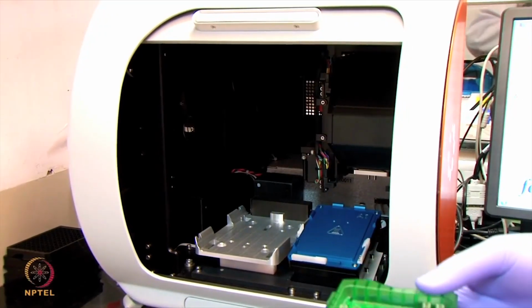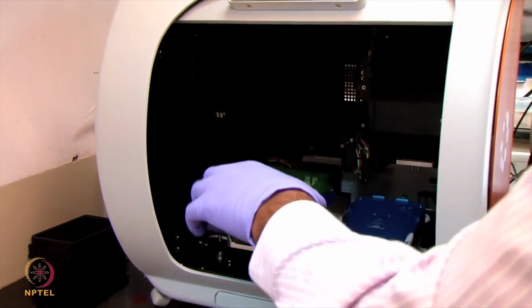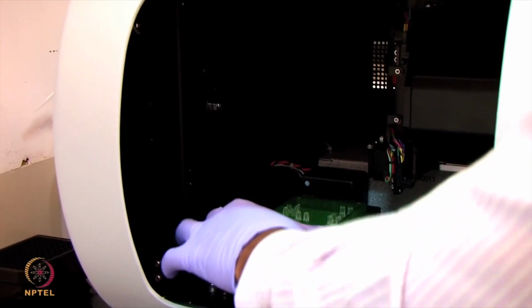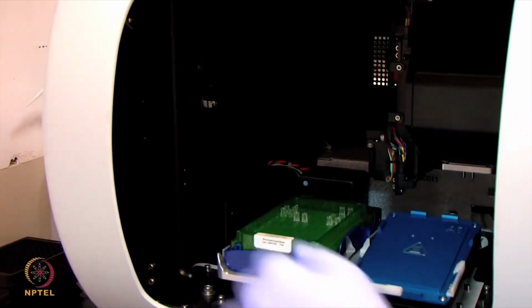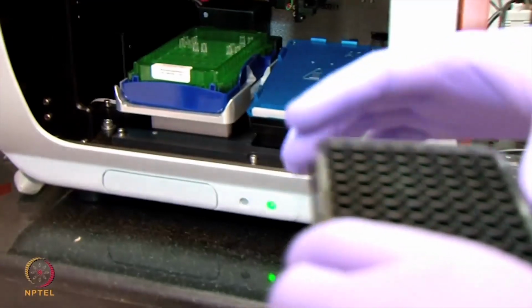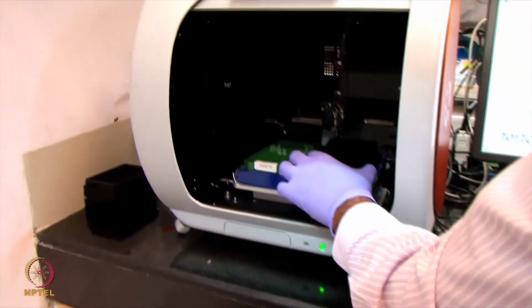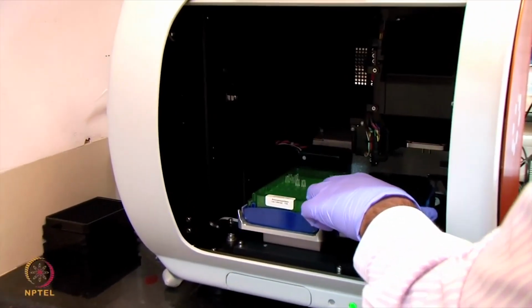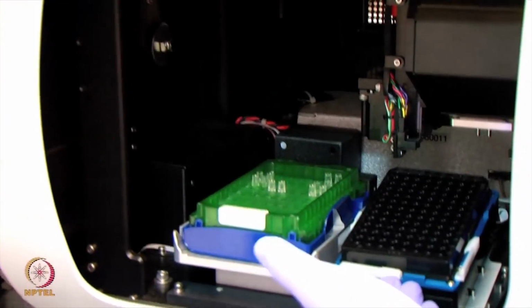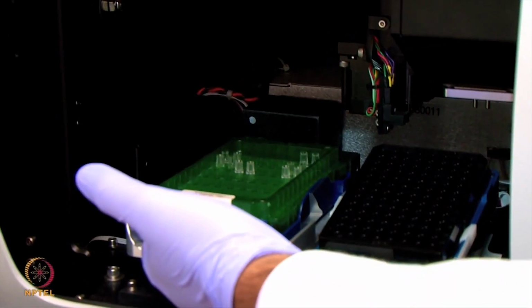Now the sensors are hydrated. I am going to place them in the instrument. The sensor holder I am placing here like this. It should be firmly fixed in the groove. And now I am going to put the sample plate which contains the biotinylated antibody. I am going to place it like this in the sample tray. This particular part we call the sample compartment. This part we call the sensor compartment.